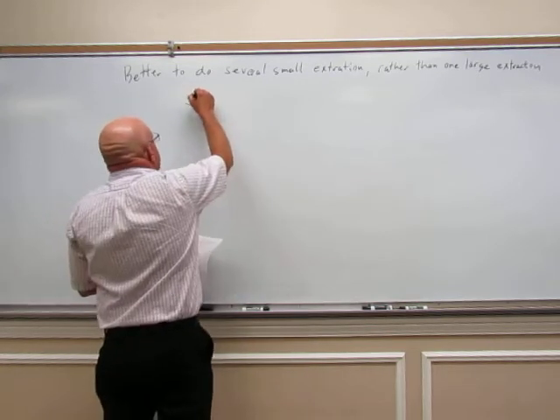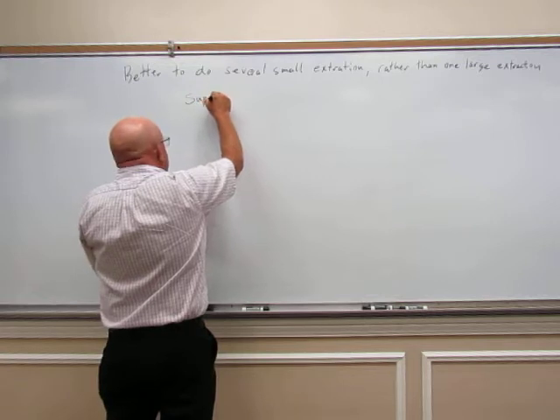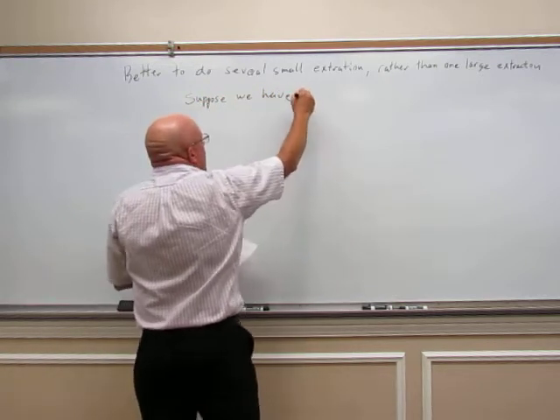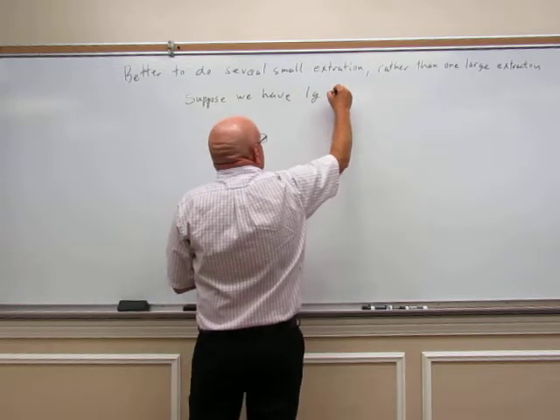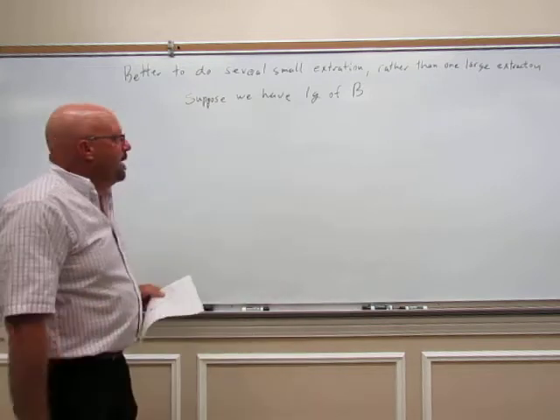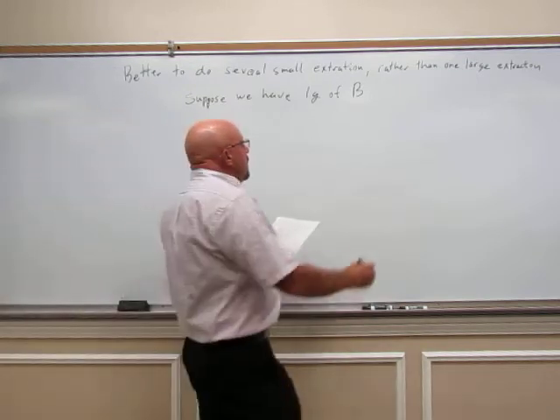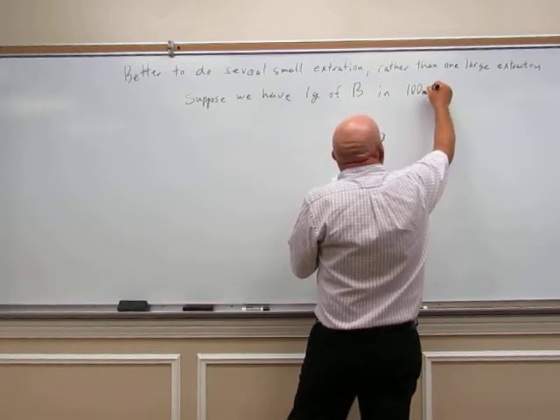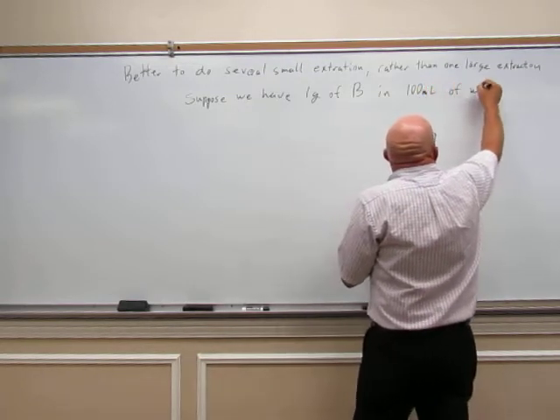Let's suppose we have 1 gram of compound B. I'm going to stick with my B that I had there a moment ago. In 100 milliliters of water.